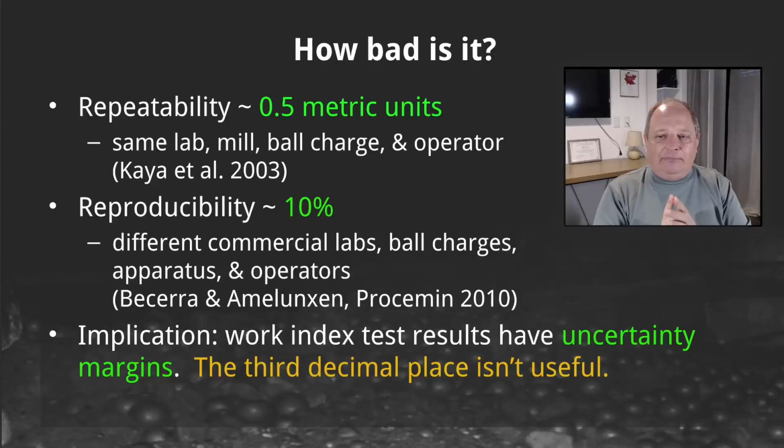Reproducibility. There's a bunch of papers out there. Somewhere between 8% and 10% reproducibility is what you can expect. So that's going to a different lab. They will have slightly different ball charges. They will have slightly different apparatus. They will have different operators.